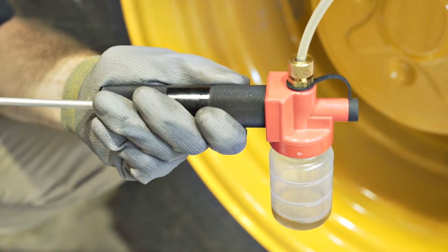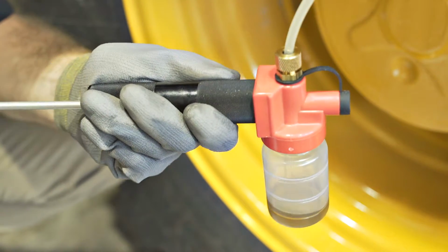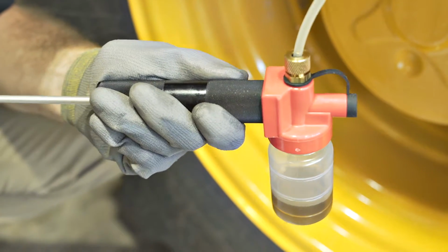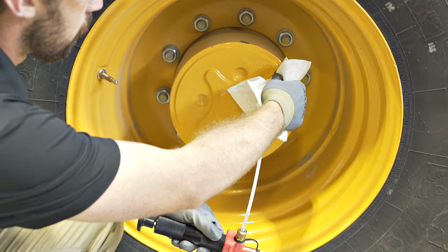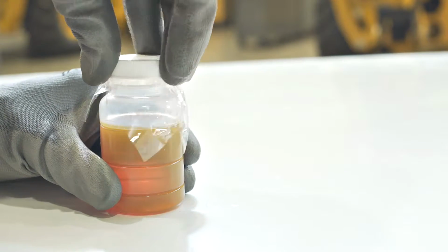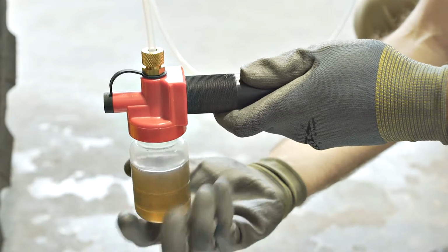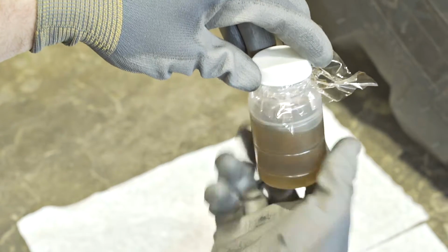Sample stationary equipment during normal operating conditions, in return lines or downstream of pumps, cylinders, bearings, and gearboxes, and upstream from the filter. Do not take samples right after a filter change, on the outlet side of a filter, or after makeup oil has been added. Freshly filtered oil removes valuable information. Adding new oil dilutes the levels of contaminants and wear metals found, which may result in conditions appearing better than they actually are. Do not reuse sample probes.